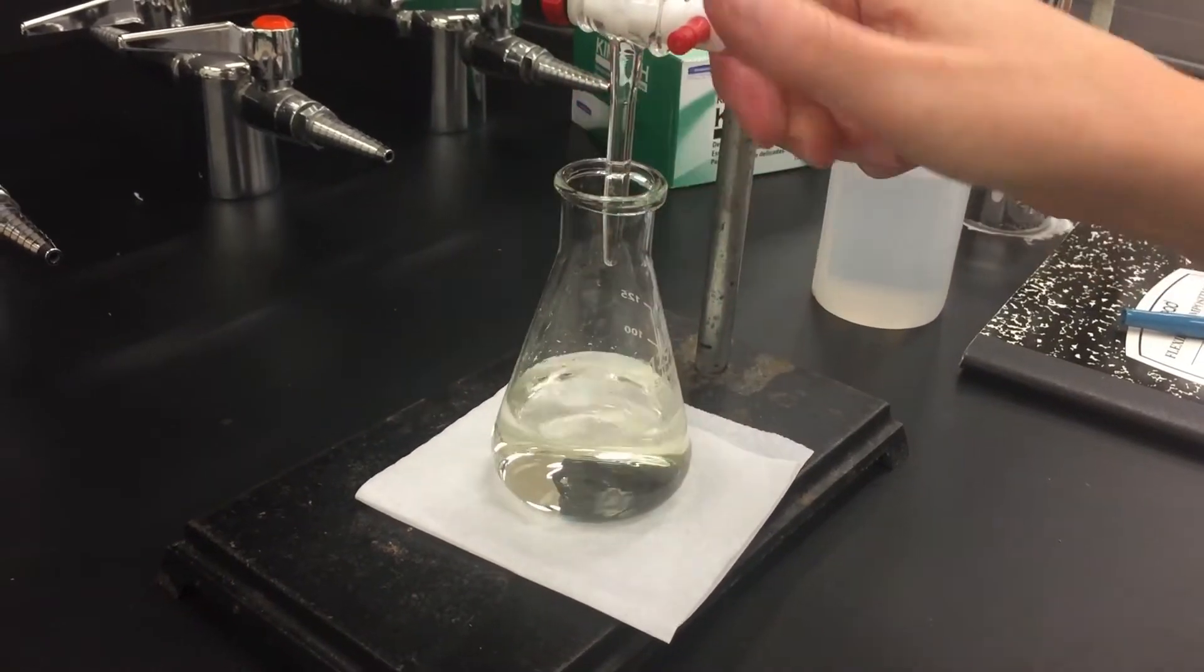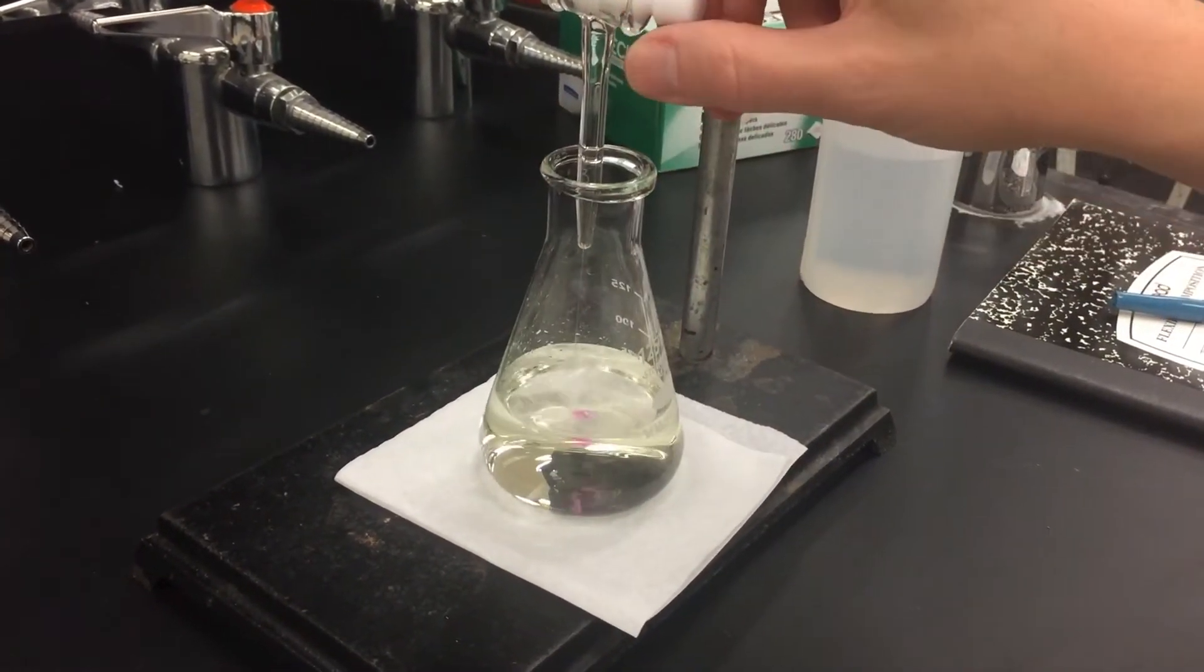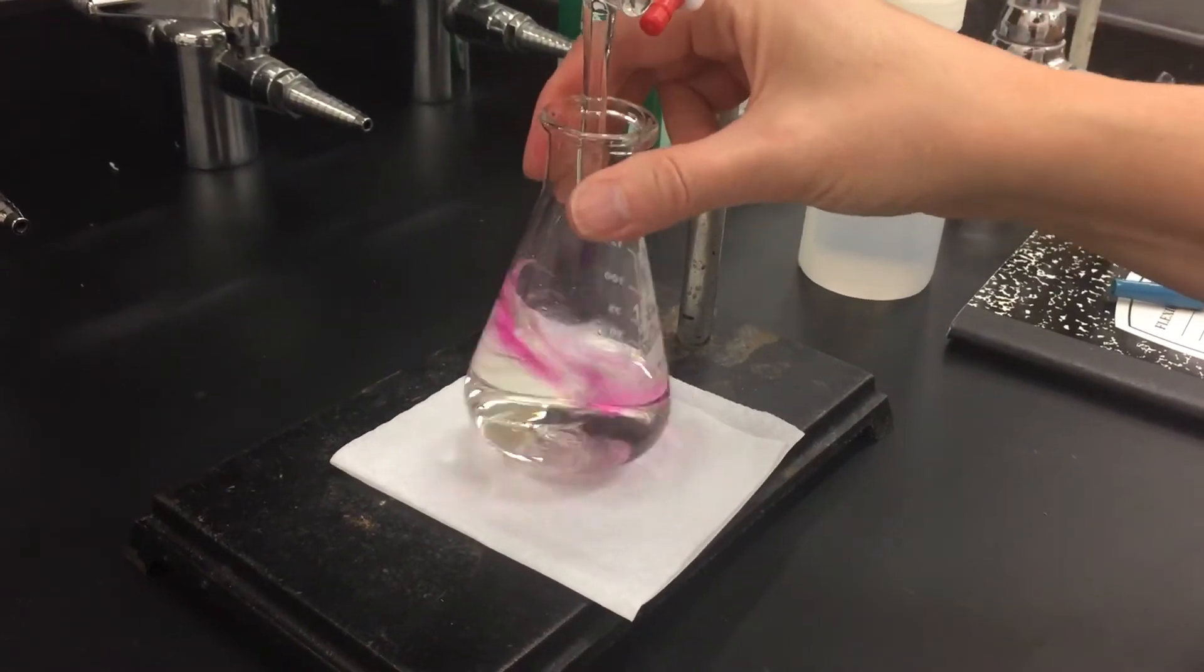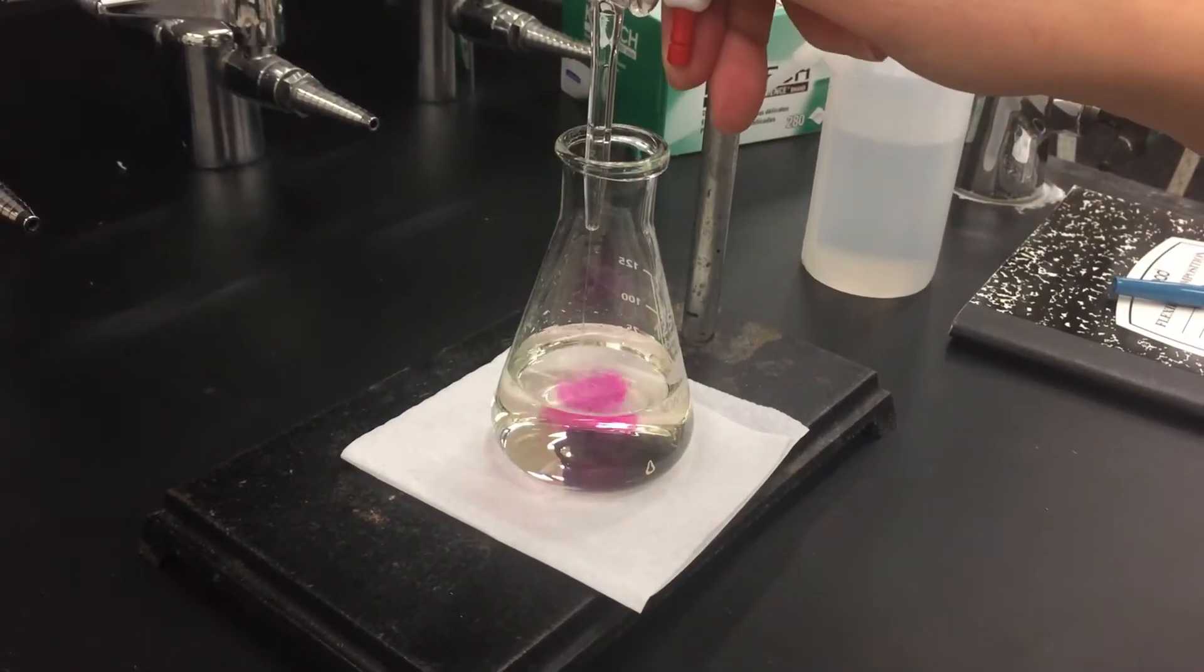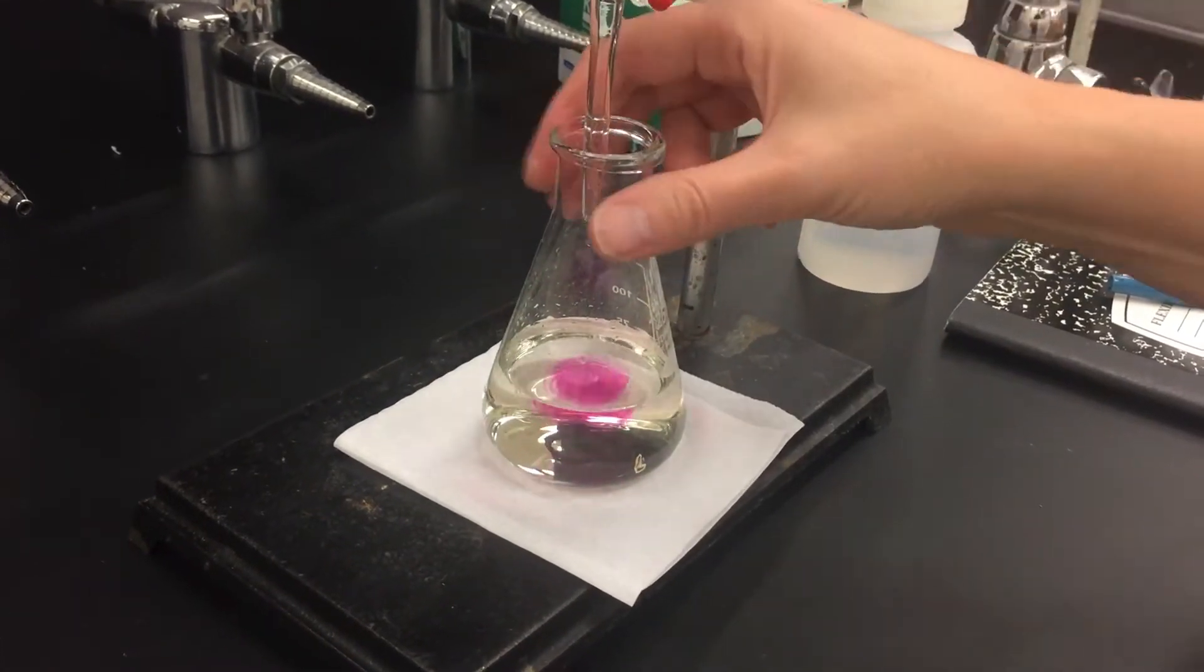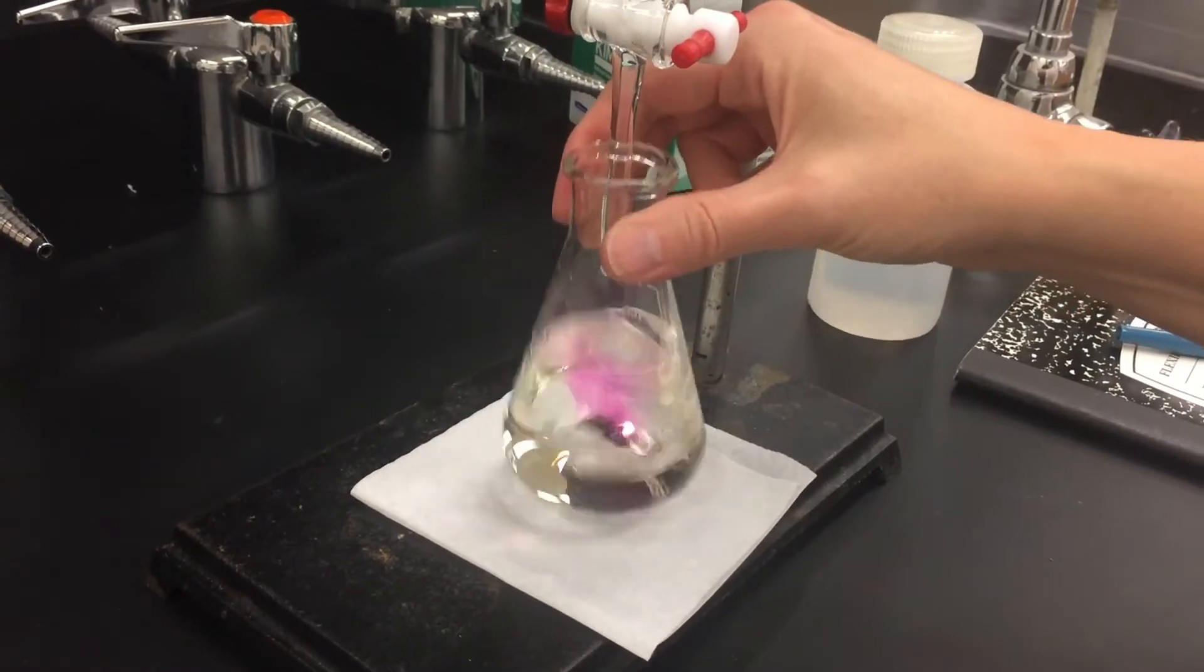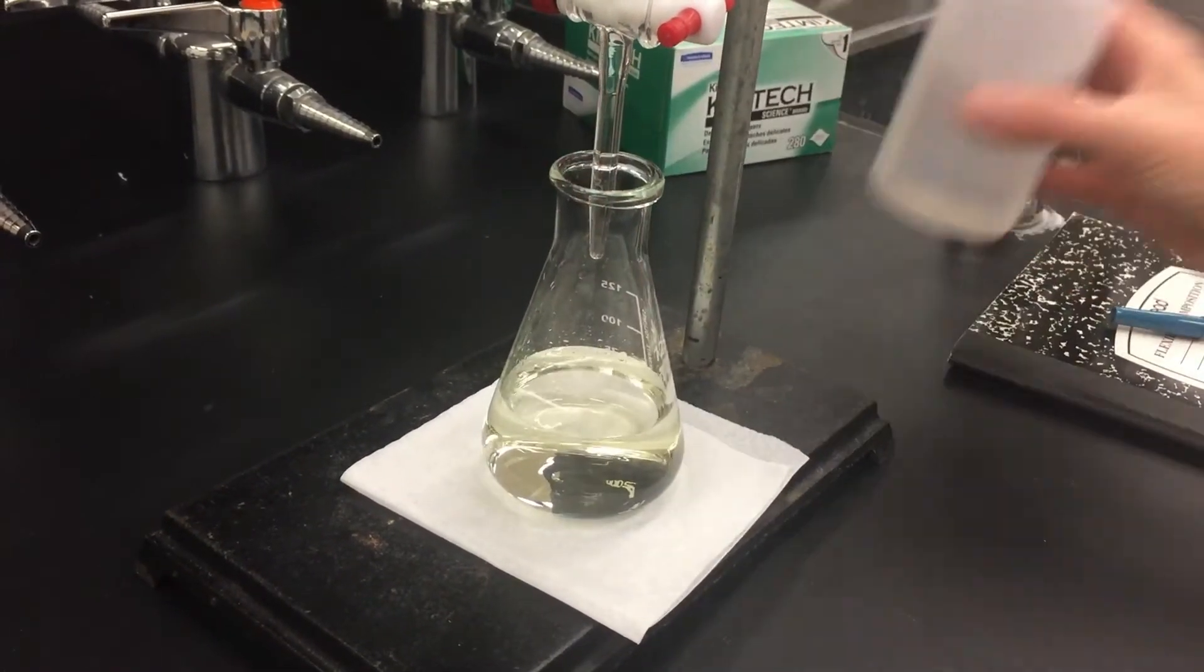Here I'm adding the base in portions and swirling, and notice every time I swirl the pink color goes away. The endpoint is going to be where it stays and we're looking for a really light light pink color so that we just exactly have neutralized the acid and the base together.